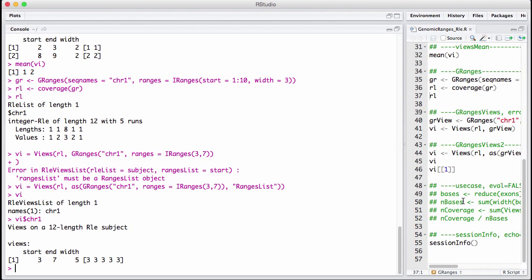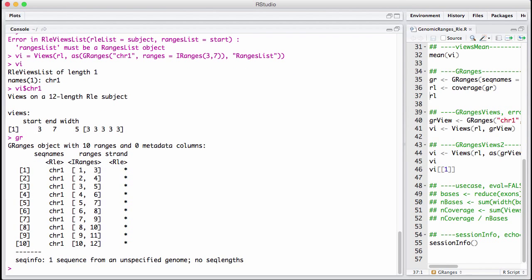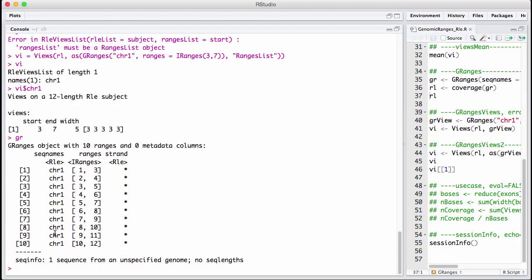So now we have learned about run length encoded vectors. We have learned that we can have them both on the integers, but we also can have them on the genome. We don't just need to have run length encoding of integers. We can have run length encoding of logicals or even characters. If you look at a G range, you can see that the seek names or the chromosome names are run length encoded vectors because we often have all the ranges in chromosome 1 next to each other. We have learned about how to compute on them using aggregate and views. We have learned how to convert a G range into a RLE by coverage. And we have learned we can slice off the coverage.